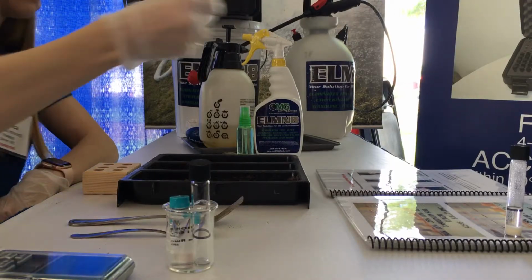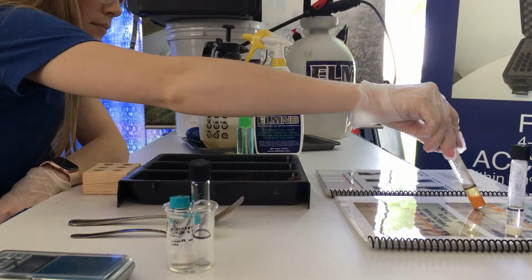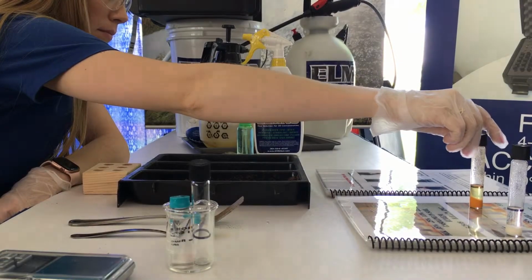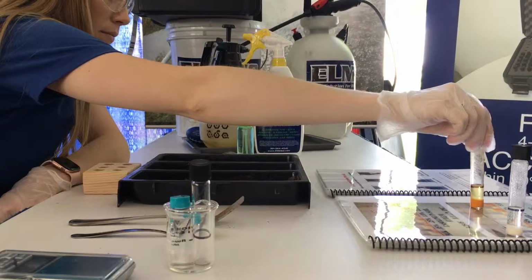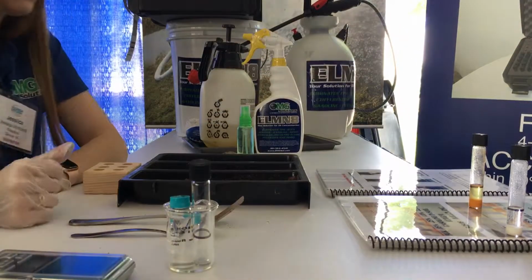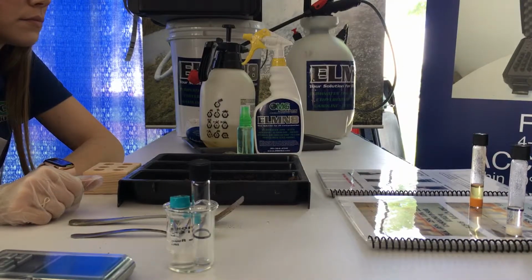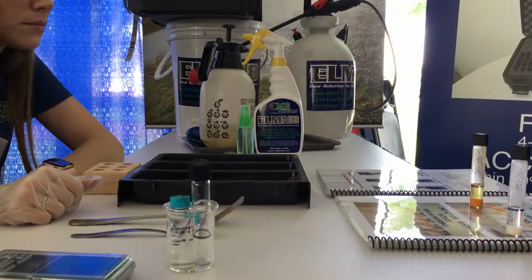And we know we added diesel, so we're going to compare it to our diesel calibration. Notice how dark that is. So it's sitting over there in between. What is that? It's in between the 2.5 and the 50,000. What does your eyeball tell you that is? It's pretty close. It's almost here, but not quite. About 30,000 or so.